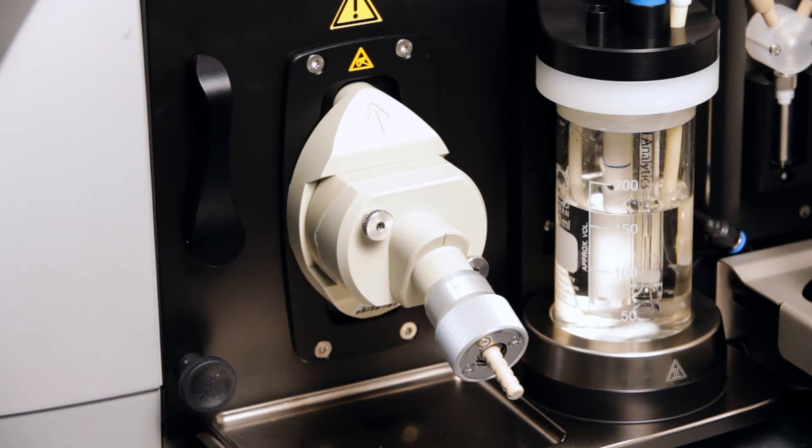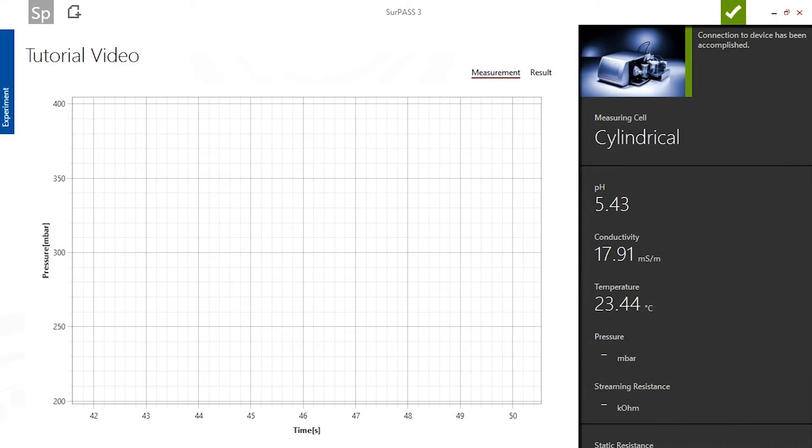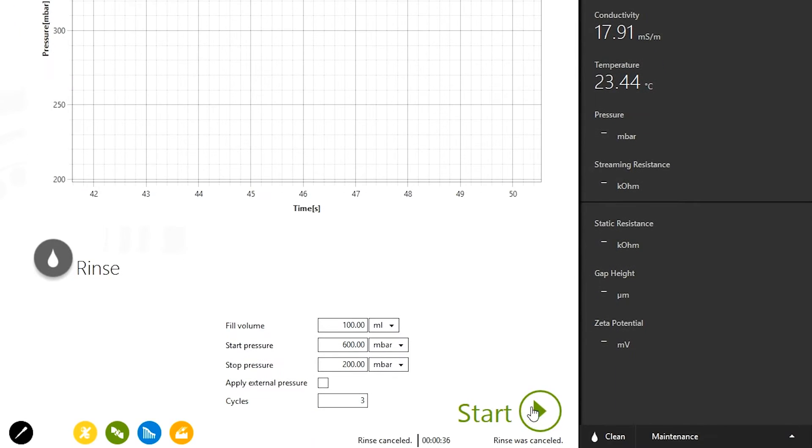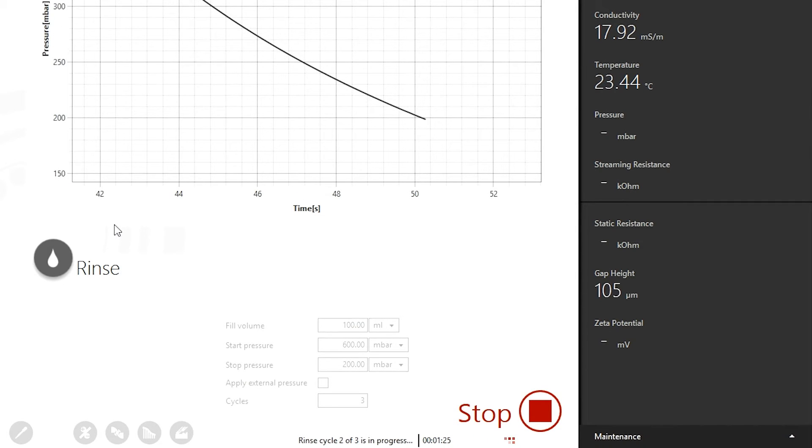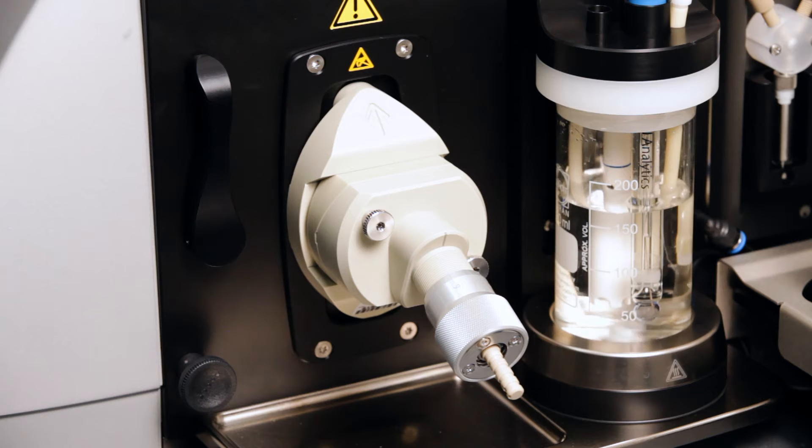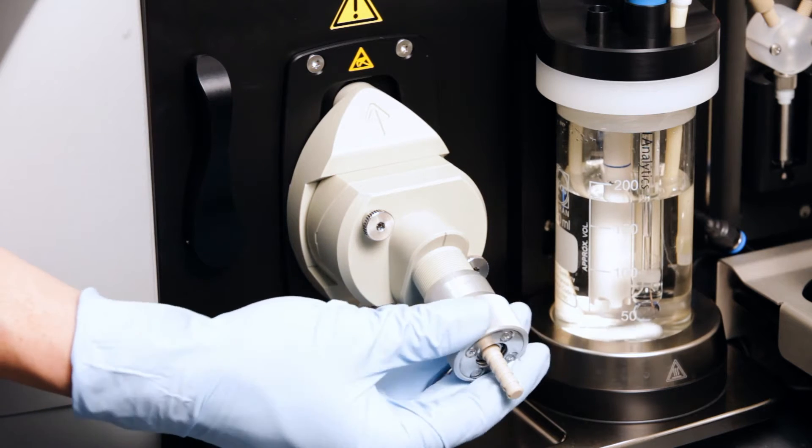The cylindrical cell is then recognized by the SURPASS III software. Use the rinse cycle to adjust the compression of the fiber sample while filling the cell with measuring liquid. To adjust the compression of the fiber sample, rotate the adjustment knob clockwise.